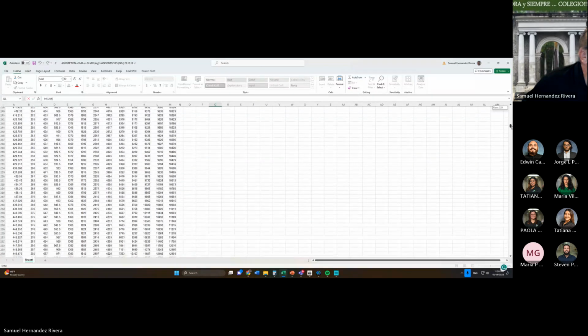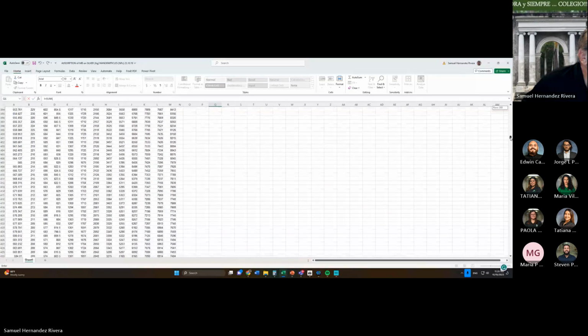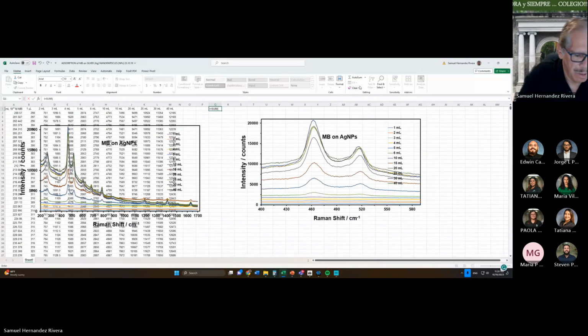B220 all the way to B437. What happened?